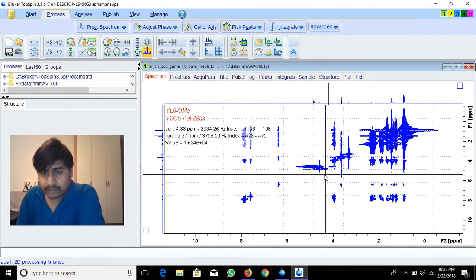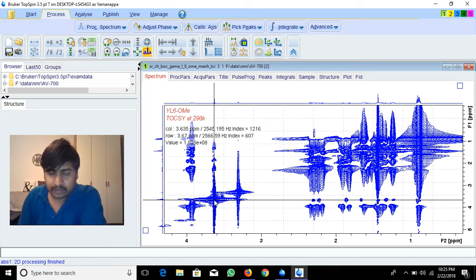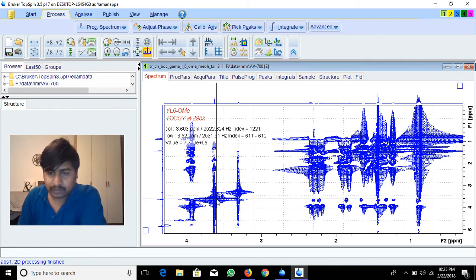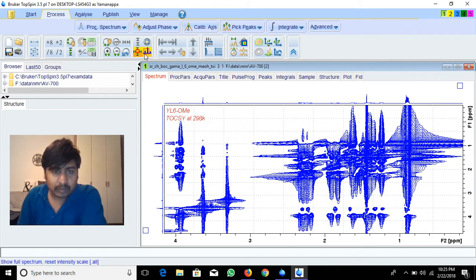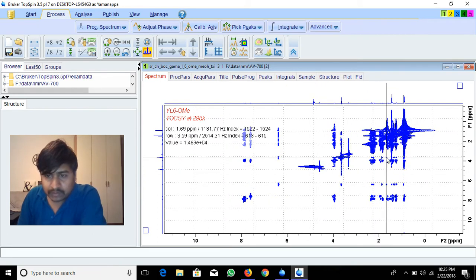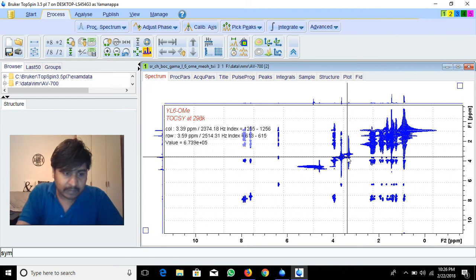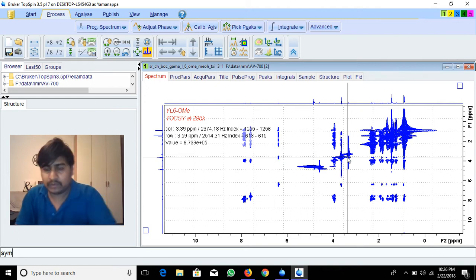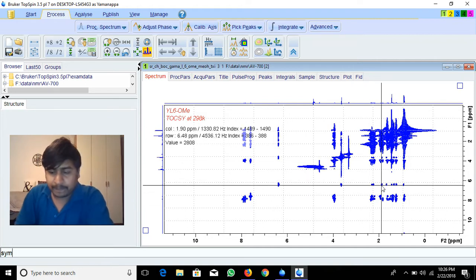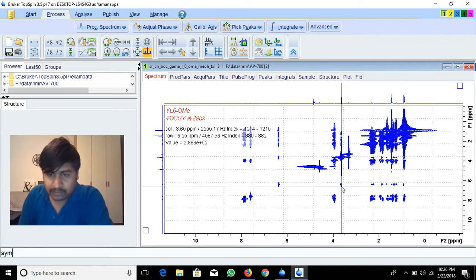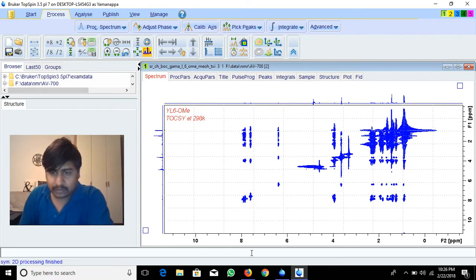Now you can see there are peaks in this line and peaks in this line, but because of the T1 noise you are not able to see them clearly. Before using the symmetrize command, you have to increase the intensity to see all peaks. I increase the intensity, then give the SYM command — the symmetric command. It will symmetrize the spectra because the diagonal peaks are symmetric — both sides are mirror images.